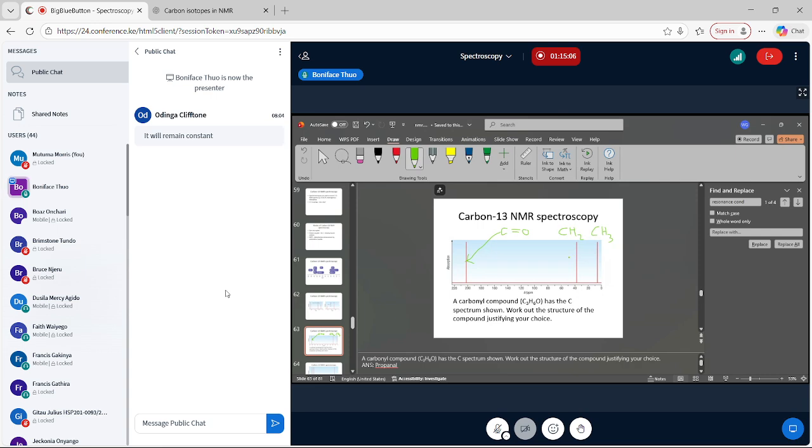And why are we saying that? Because if we had two CH3, then they should be in the same environment because we only have 6 hydrogens. So the only remaining group is a hydrogen somewhere.